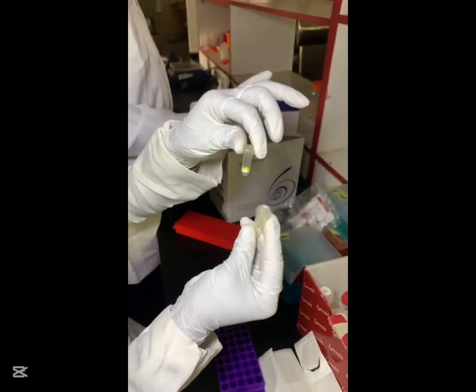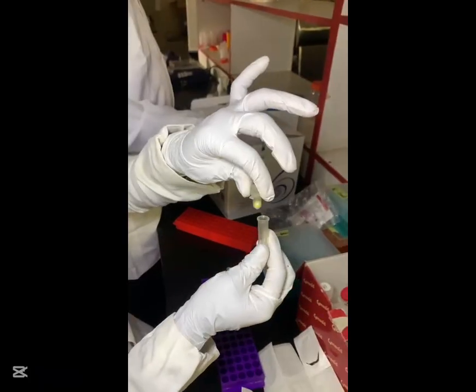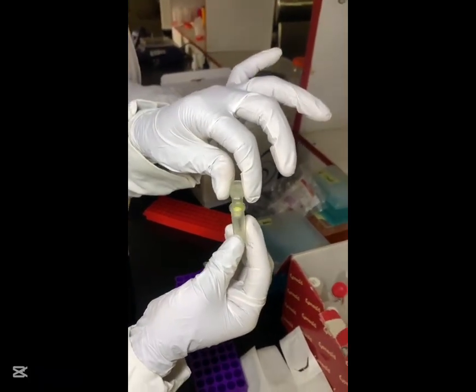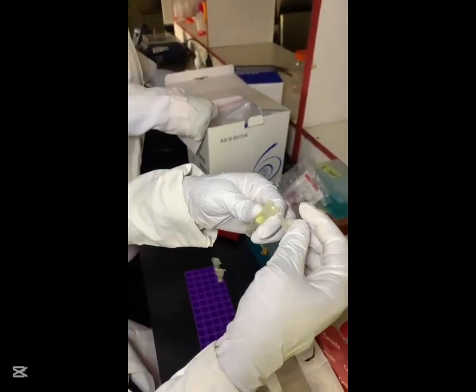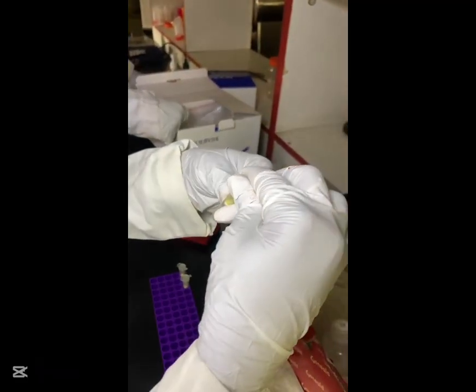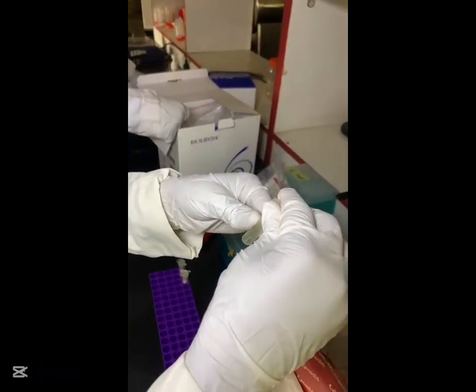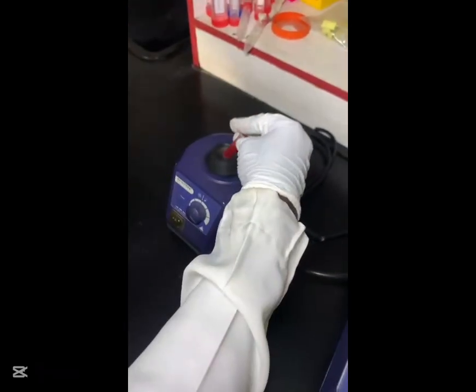Okay, so this is how the column looks. It is attached to a collection tube. There is silica in between those two. That's where the DNA or your RNA is going to bind. So you put your wash buffer, elution buffer, or whatever reagent you are asked to inside. Then when you spin it, the flow-through goes into the collection tube. Then you can discard it if asked to.